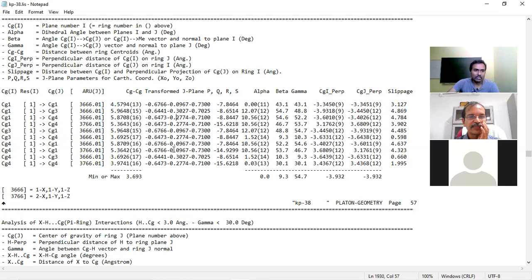That depends. In some cases, even the editors or the reviewers will ask you to include them if they find that it is significant when we neglect it. That happened in our case also. In one case, our Dr. Zeller asked us to include one pi interaction that was between the alkene, like a C double bond C, and the metal. We had neglected those things, but he asked us to include those pi interactions. So in one paper, we have included that also. He showed that there are some other interactions and requested us to include them. So in those cases we include, otherwise we usually neglect those things.